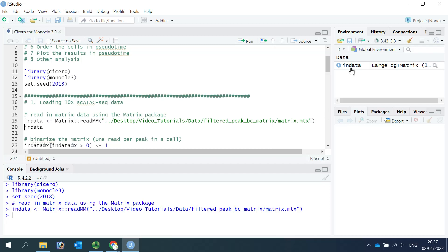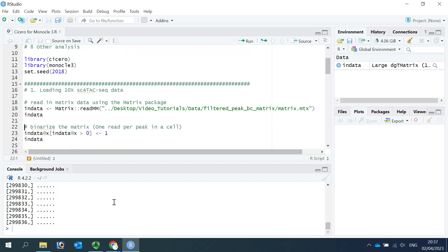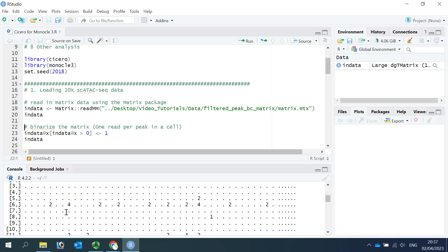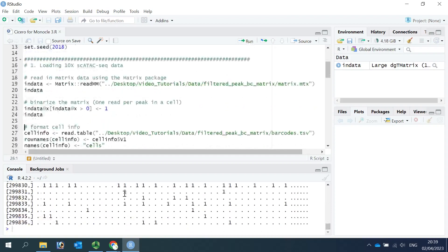You can see we have INDATA in the data window. It is a large dgTMatrix. Looking at the data, the rows are named by numbers and we don't have column names. Here are the counts for the matrix data — a dot means the count is zero, and you can also see counts of two, four, and one. Because the open chromatin region in a cell should be just one, we need to change any count into one. You can see now we've changed the count to one for each peak in each cell.